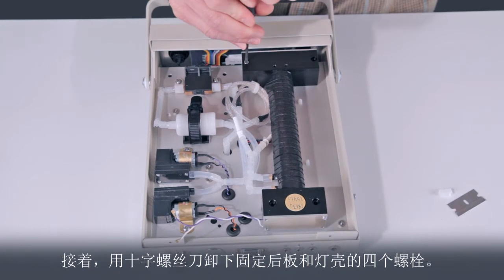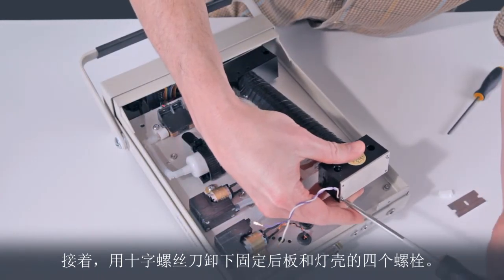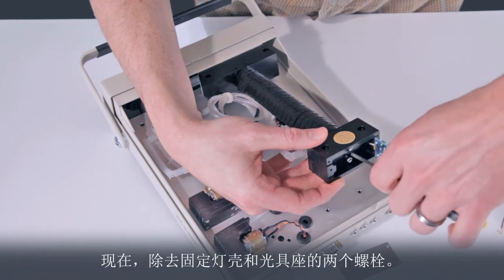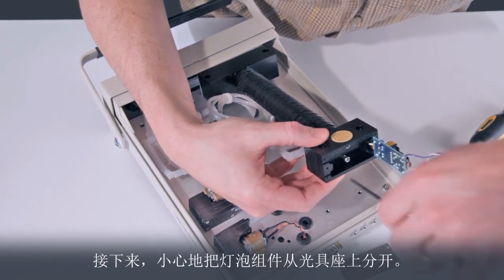Now, using a Phillips screwdriver, remove the four bolts that hold the back plate of the lamp housing. Then remove the two bolts that hold the lamp housing to the optical bench. Next, carefully separate the lamp assembly from the optical bench.